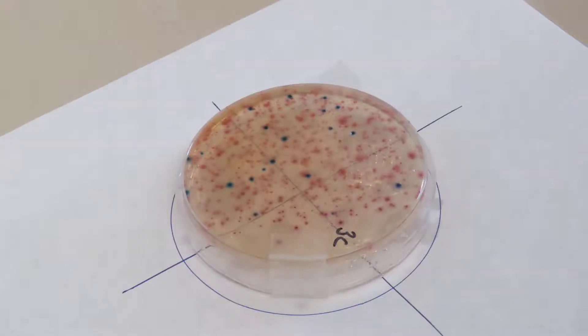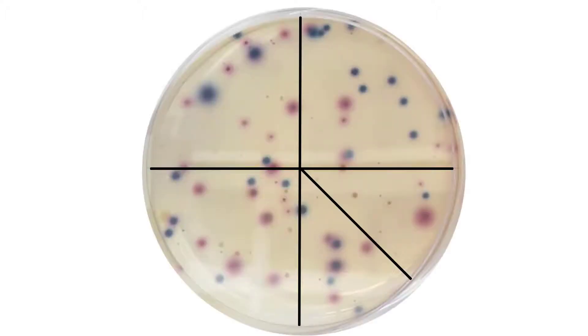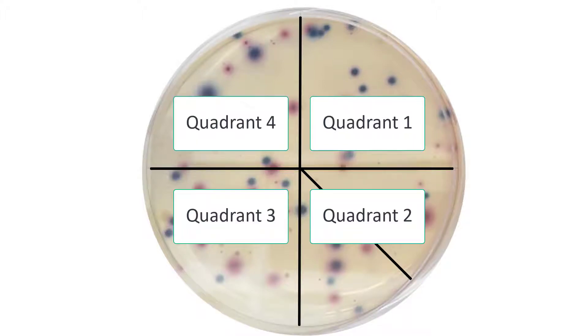It may be helpful to draw a circle divided into quadrants on a white sheet of paper that you can place under your plate. This will help you establish a starting point from which you can count. For instance, begin counting in the quadrant at the top right and continue counting each quadrant until you have counted the entire plate.